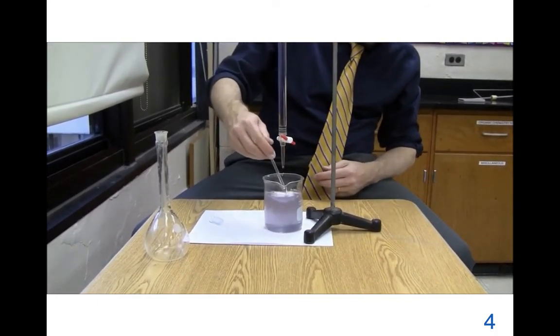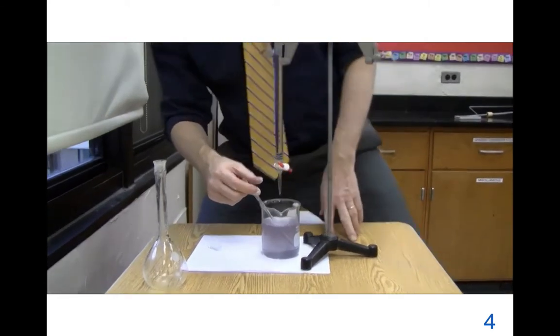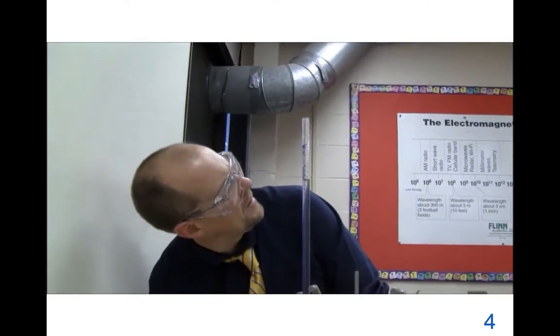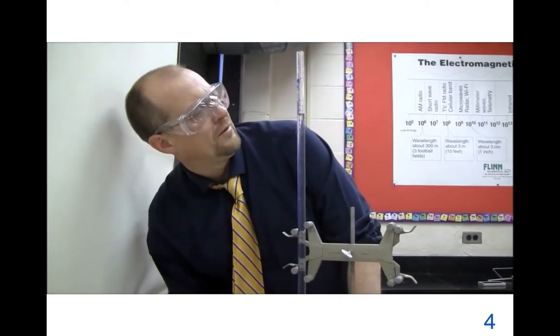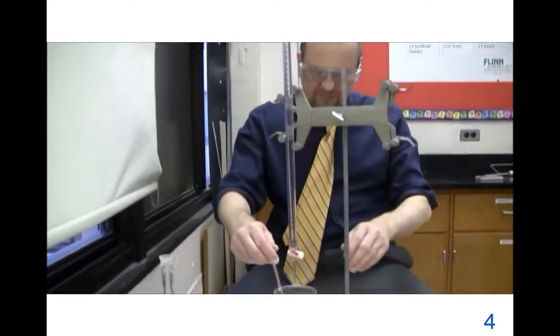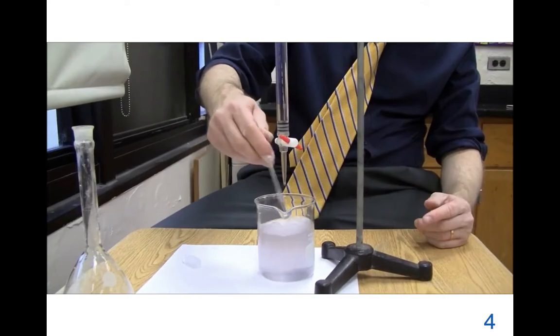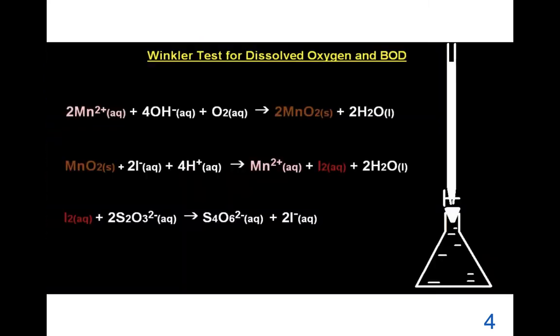Seems to be getting more colourless. Let's see if that's the end. I'm writing down in my brain 2.7 milliliters. 2.7 milliliters. You know what? It wasn't an instantaneous reaction. I think we're pretty much done.